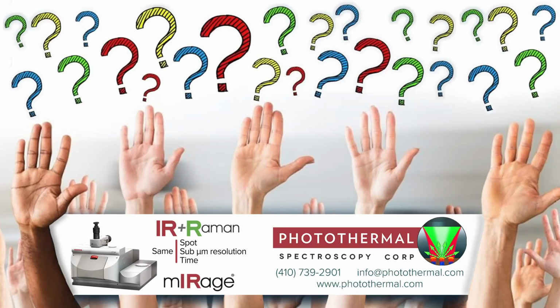So we do have some time for questions, and I can see a few questions coming in. I think some of them will be for you and some for me. The first one looks like it's definitely for you, and it says, can you be sure that the iron and amyloid are truly localized at the same three-dimensional point?